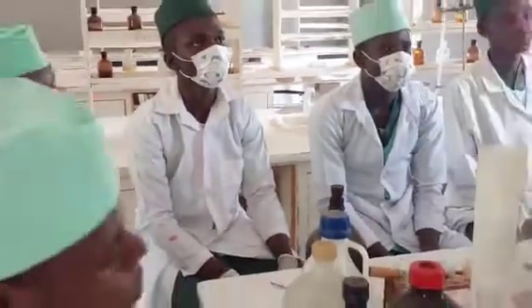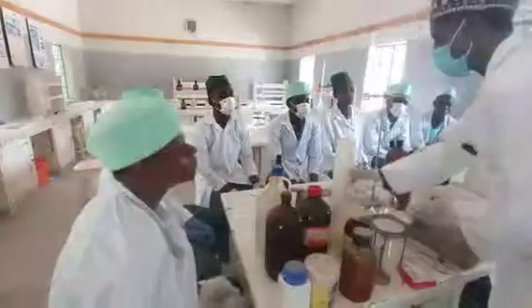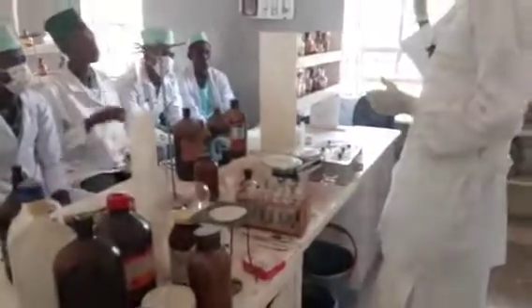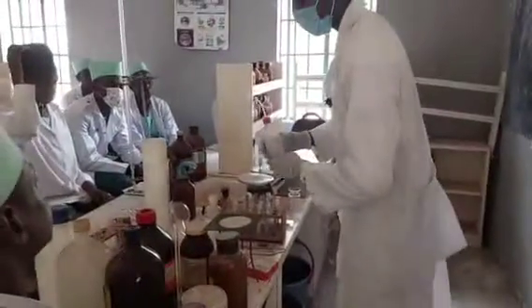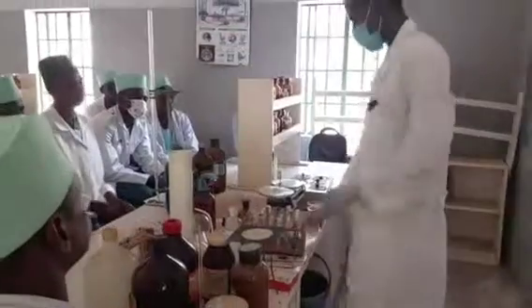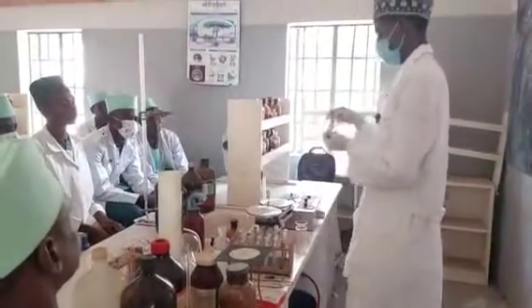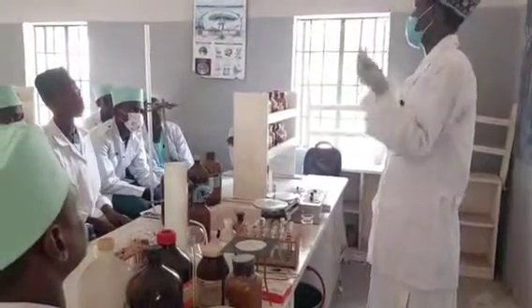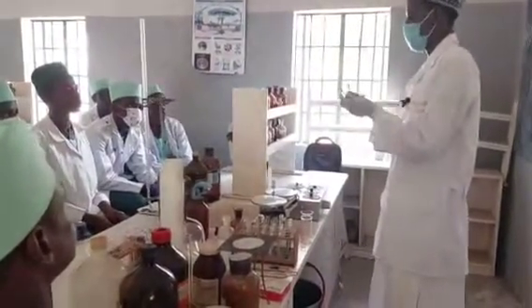We have different sizes of it as well. This is our wash bottle. You use it for rinsing the apparatus. So that is all we can say for now. This is our litmus paper. We have the blue and the red, used for testing acids and bases.